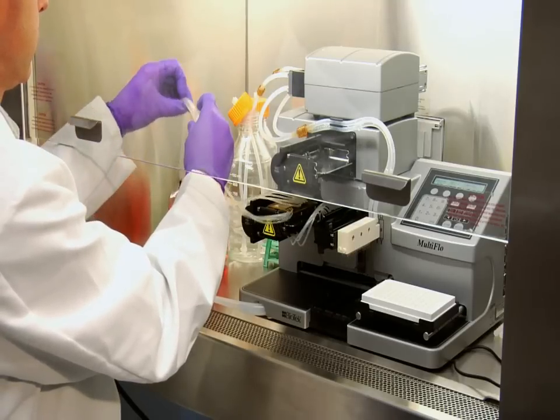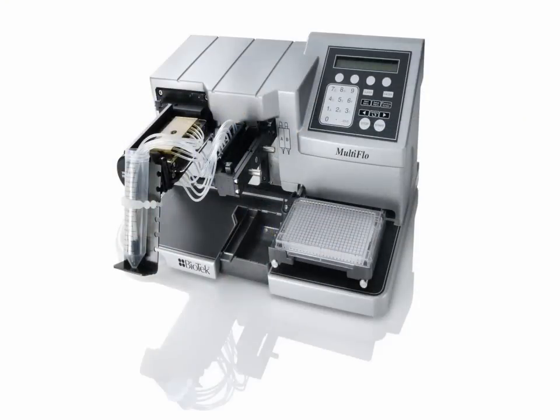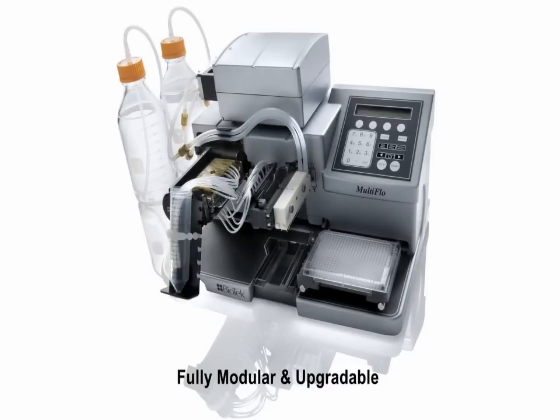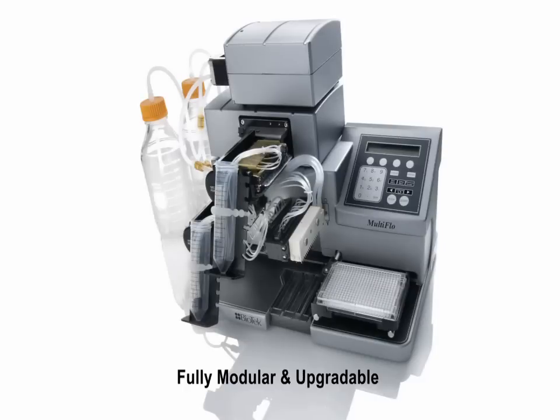The Multi-Flow is fully modular and upgradable. Labs can purchase only what they need today, and when needs change in 6 months or the instrument is repurposed, additional reagent channels can be purchased and quickly upgraded right on the bench.